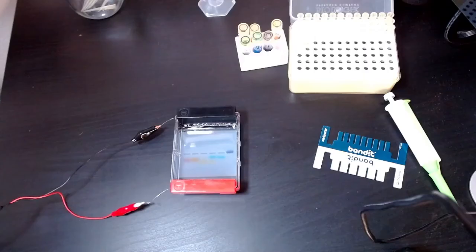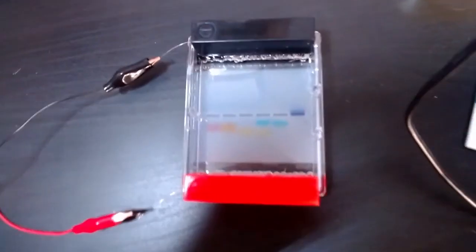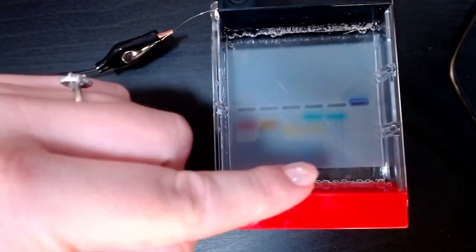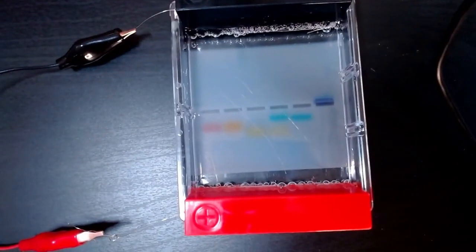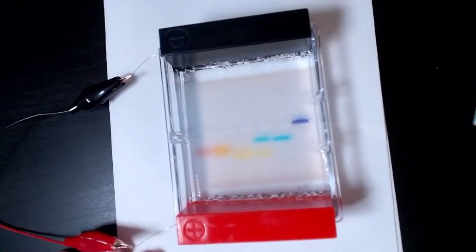And what we're going to do is flip back over to our experiment here, and zoom in on our gel. So I'm going to take our camera off the tripod, and we're going to get nice and close to this gel here. And I hope that you can see this. So we have our red, orange, yellow, green, blue, and purple bands. And I'm actually going to move these onto a piece of white paper so that you can see them a little bit clearer.